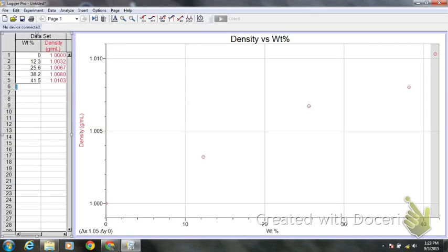So this is close. Now that one step was at 5 maybe where you have to draw the green line. So you can do it a few ways. I'm going to do it the old-timey way, which is basically going to pull down from the word menu, but I bet one of those icons would do it for us too.